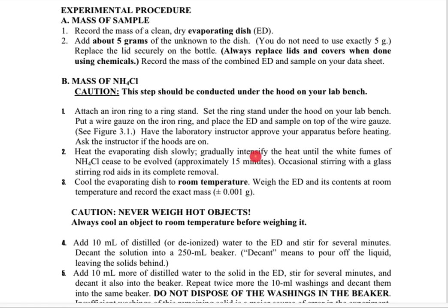One thing I would recommend is reading through the procedure, at least briefly, before watching the video. And then maybe even having this out while you're watching the video. It may help put some of the pieces together a little bit better. But in the video, I do talk about the experiment and what I'm doing. I don't necessarily reference like part B, part A, etc. The procedure that you see here is basically the sequence that you see on the video.